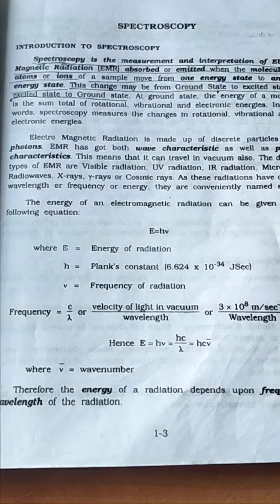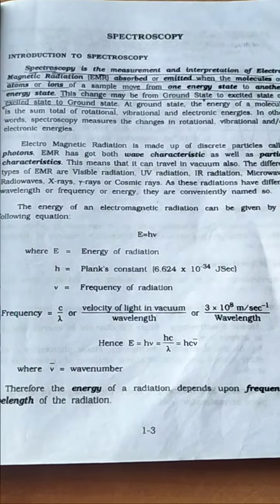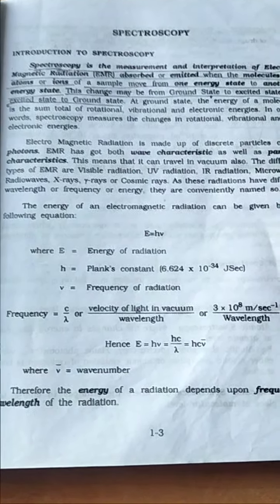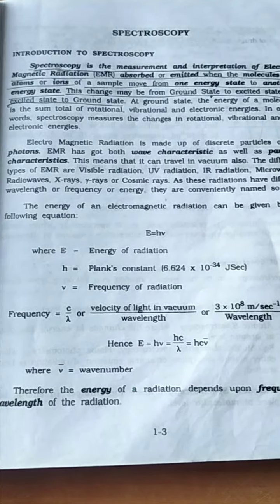Today's topic is spectroscopy. Introduction. Spectroscopy is the measurement and interpretation of electromagnetic radiation, otherwise called EMR. Here the principle is absorption or emission.